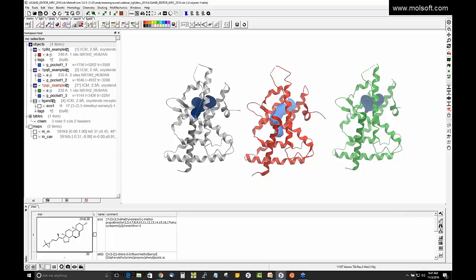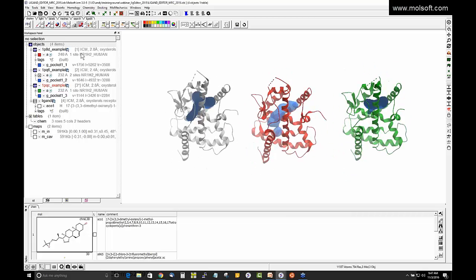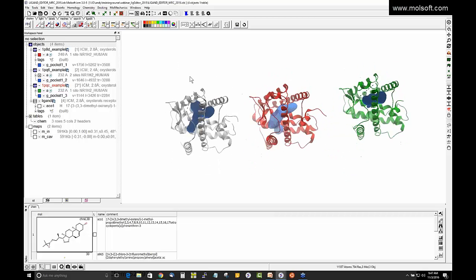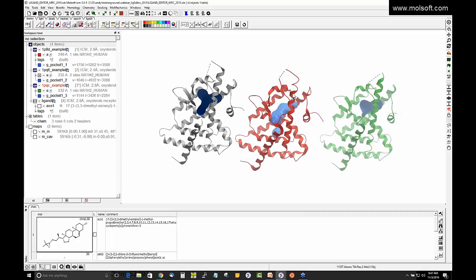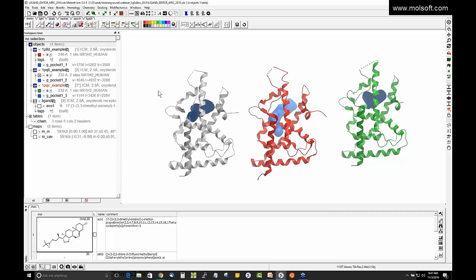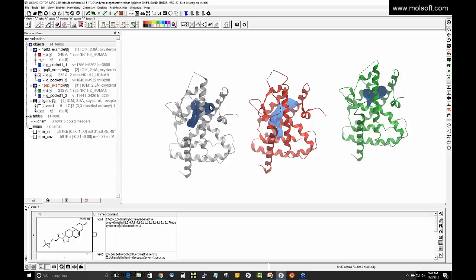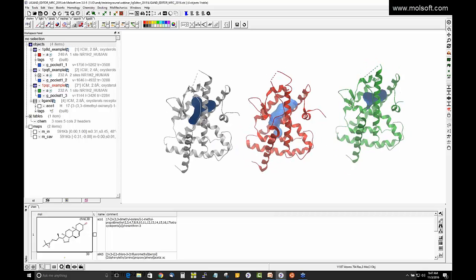I'll have to get back to you. So we have 3 nuclear receptors, which actually it's the same nuclear receptor, but the pockets in nuclear receptors are notoriously quite flexible. So we can see that in these 3 crystal structures of the same protein, we have different pockets in size. So we can modify our ligand using information from each of these 3.